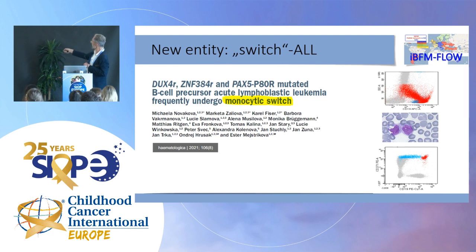So they grow out of the lymphoblasts, which are down here, and then they tend to lose CD19. They really develop into something completely like a monocyte at the end. You won't understand that this is or has been a lymphoblast. And it grows out in that direction to stay there where the monocytes are.